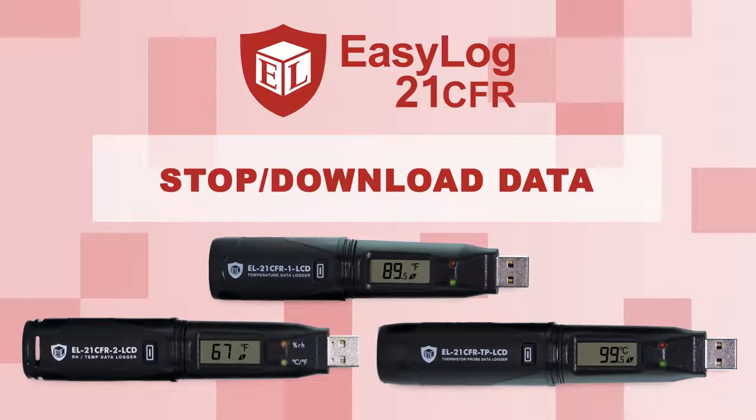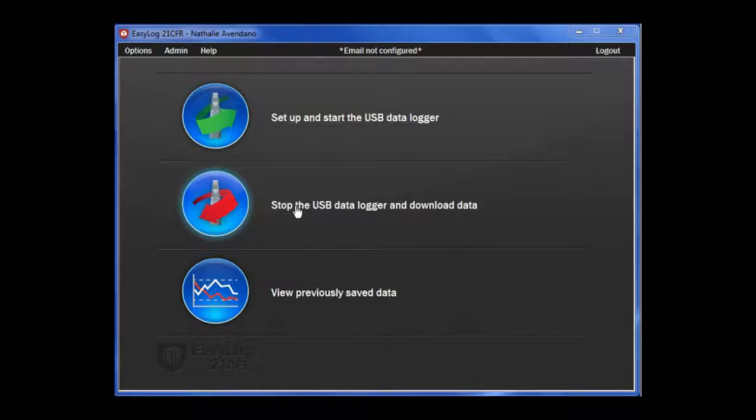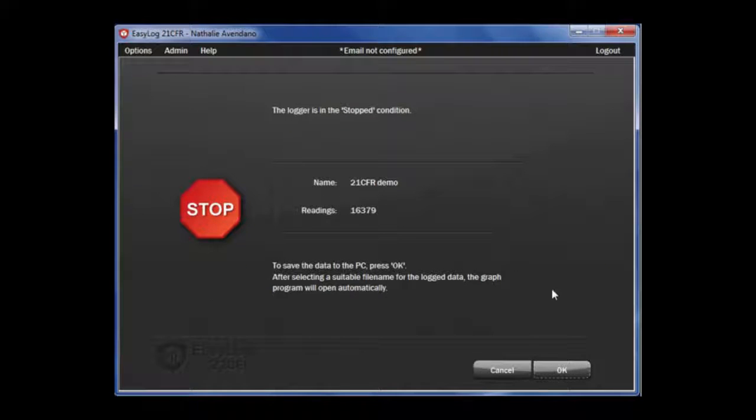In this video, I'm going to be showing you how to stop and download data from the 21 CFR EasyLog USB data logger. To begin, click Stop the USB data logger and download data. Then click Yes to continue. This will bring you to the logger stop condition page.